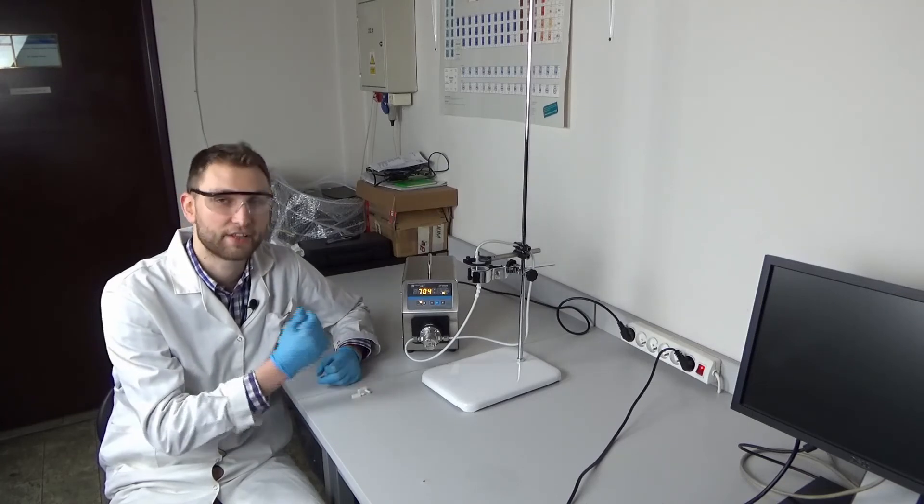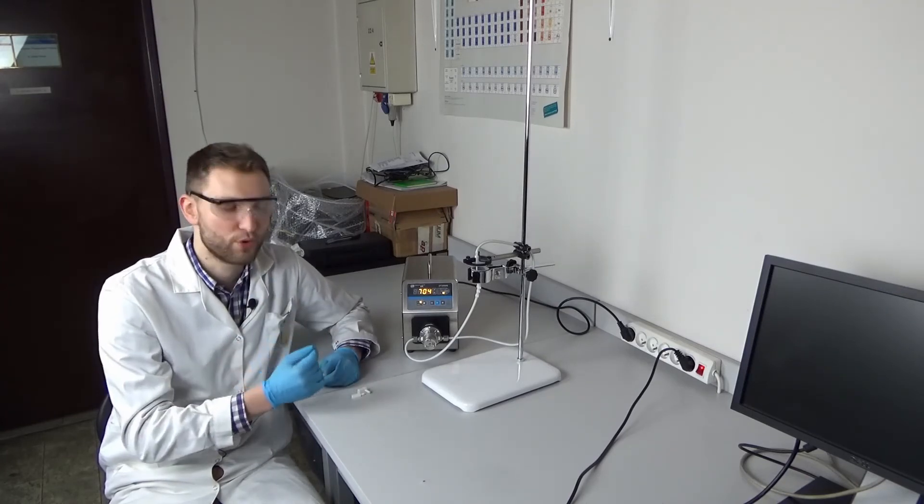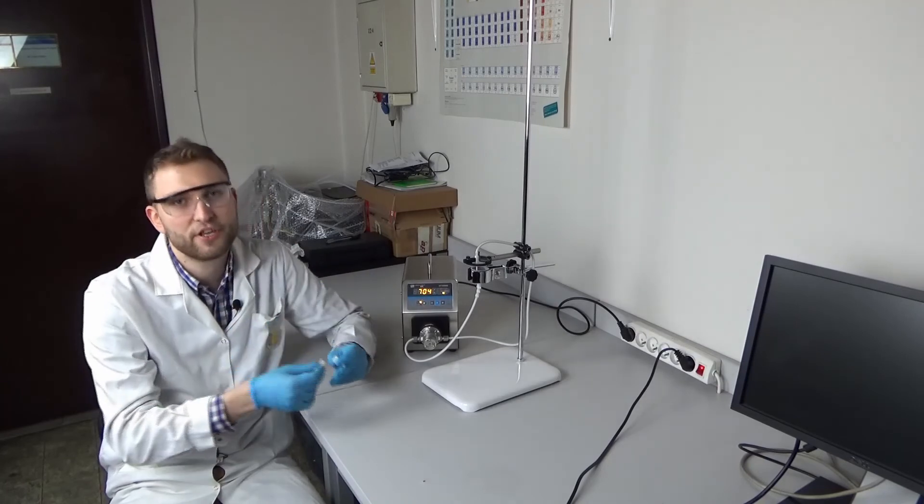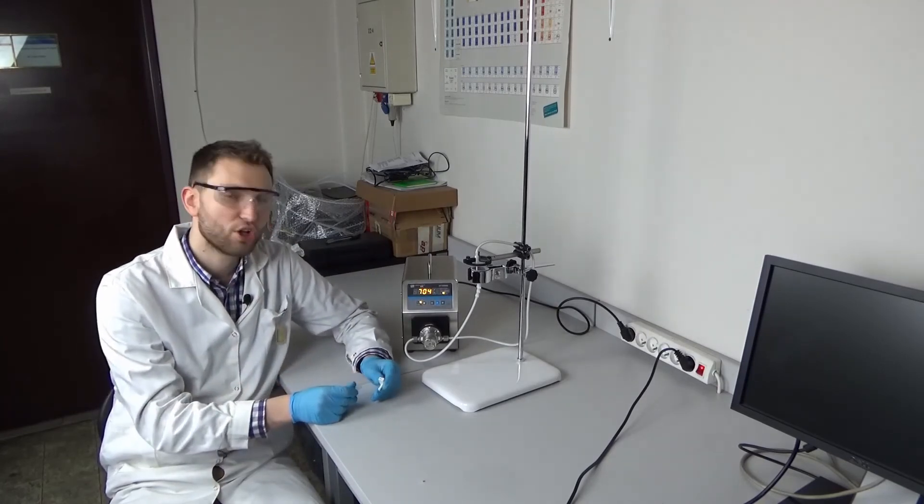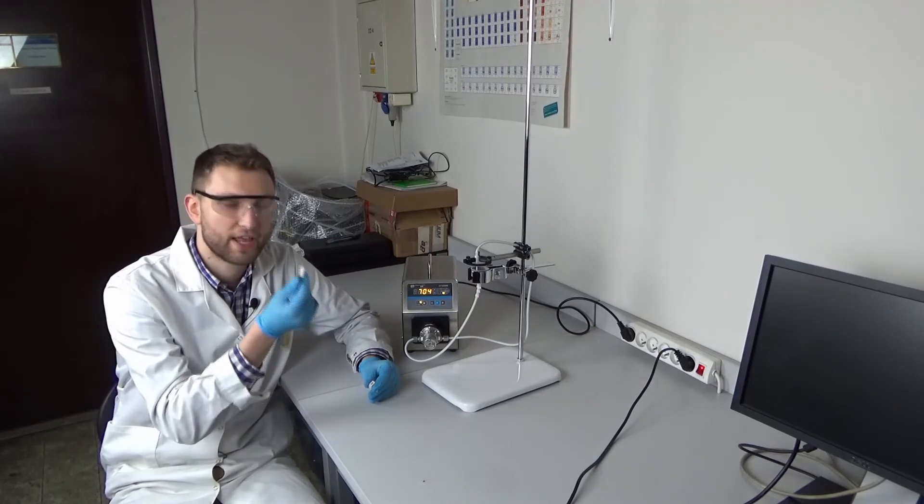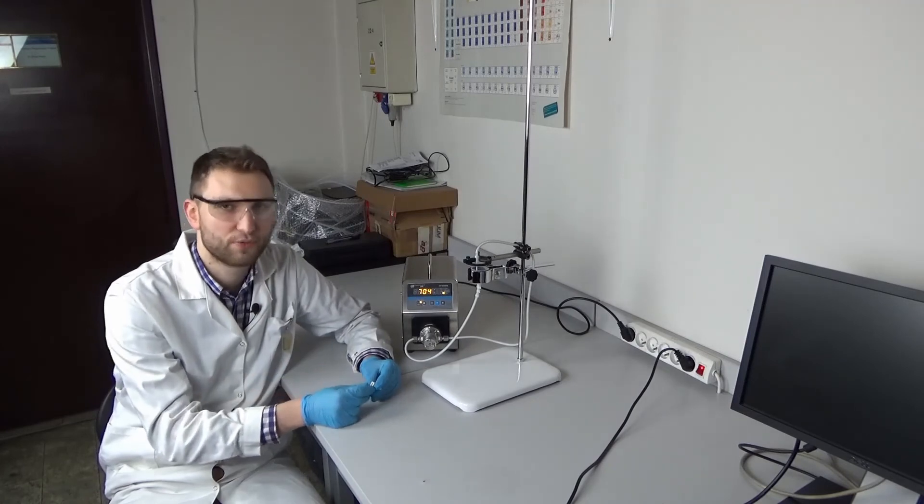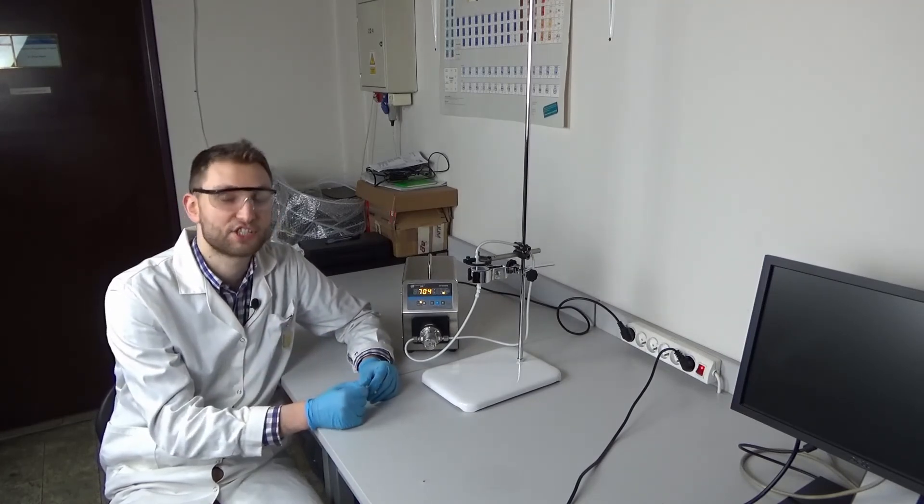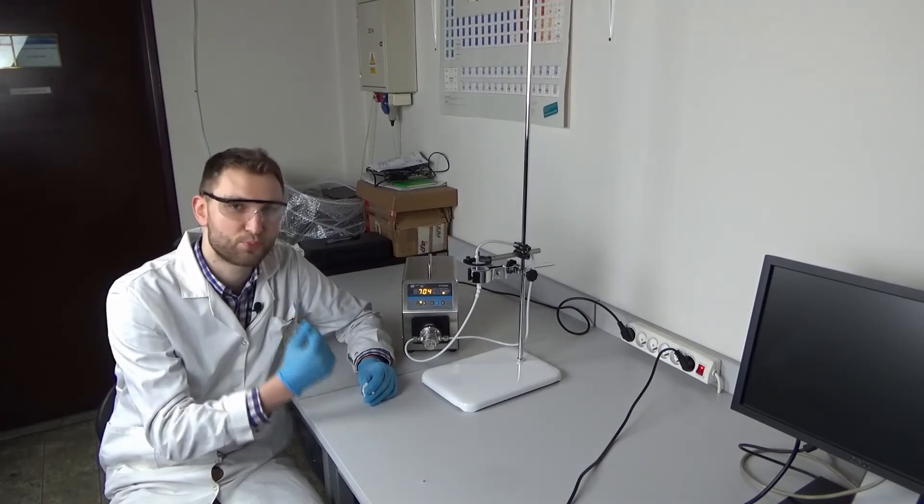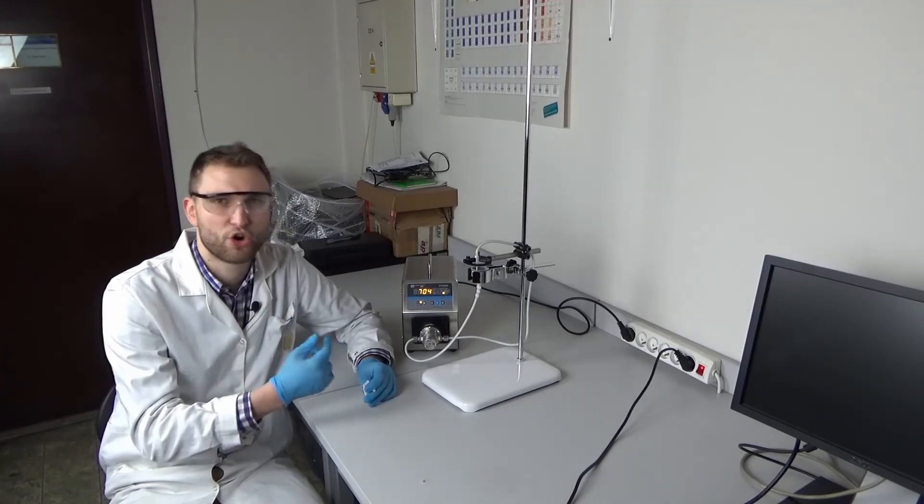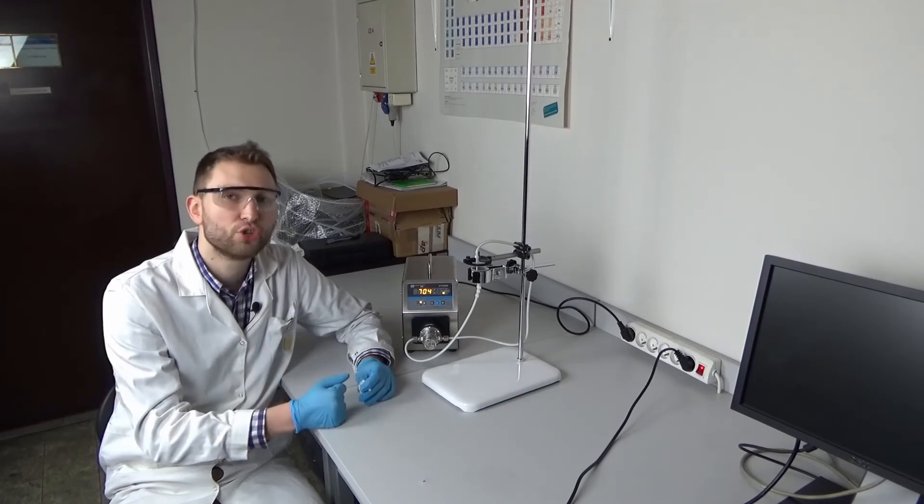So now let's see the other type of nozzle that we use in our lab. This is a 3D-printed element made of polylactide with a squared cross-section and jet thickness of 3 millimeters. The great advantage this printing approach provides is the possibility of making the nozzle at basically any time we want with different dimensions and different shapes relative to their intended use. It's also way cheaper to print a single polylactide nozzle than to buy a quartz cuvette. However, the trade-off is that they are not as resistant as the previously shown model, so some strong organic solvents like toluene or hexane might damage the nozzle during longer measurements.